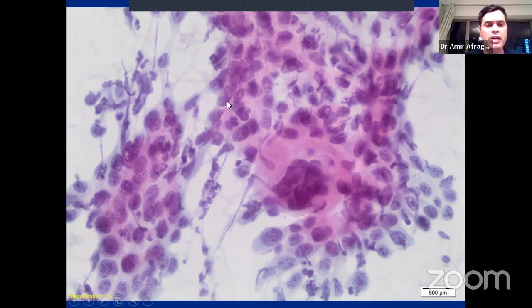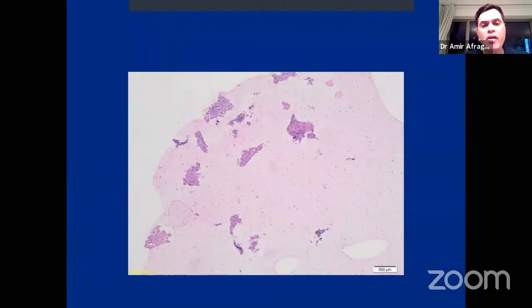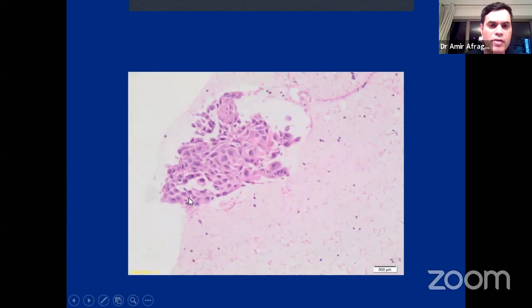You can see we have got a group of highly atypical cells that are showing dark chromatin, high NC ratio. You can even see some multinucleated cells around here. So what I asked for is to spin down the material that I collected, or the liquid-based medium, to create a microbiopsy, where you can see the morphology of the cells quite better.